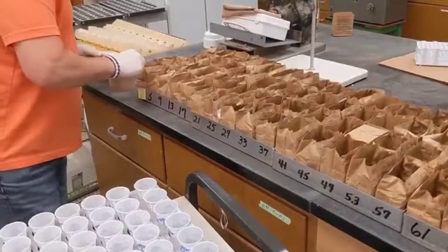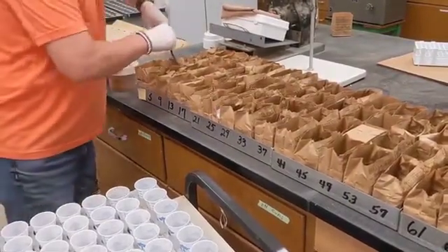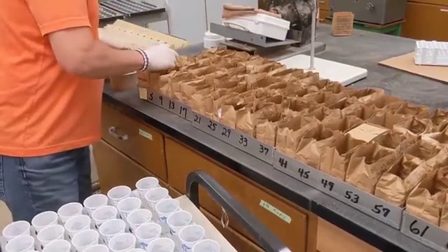After each sample has been ground, each sample is then scooped into a pH cup. The scoop used is a standardized volume of 15 milliliters.